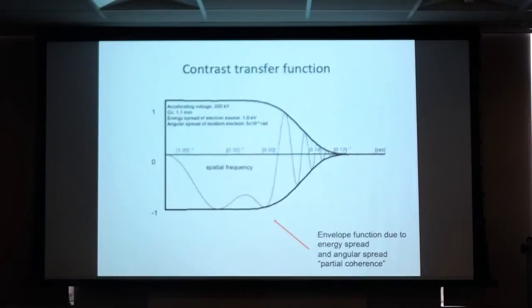Of course, in order to do that, we need to know the contrast transfer function. So there's another step in between, which means that we need to find it out directly from our data. You might say, well, you know the defocus setting of the instrument. Well, these are nominal settings. You cannot trust them. If you put the instrument at a particular defocus, that's not necessarily the defocus that the specimen sees. So the defocus, or CTF, really needs to be determined from the data, not from the instrument.